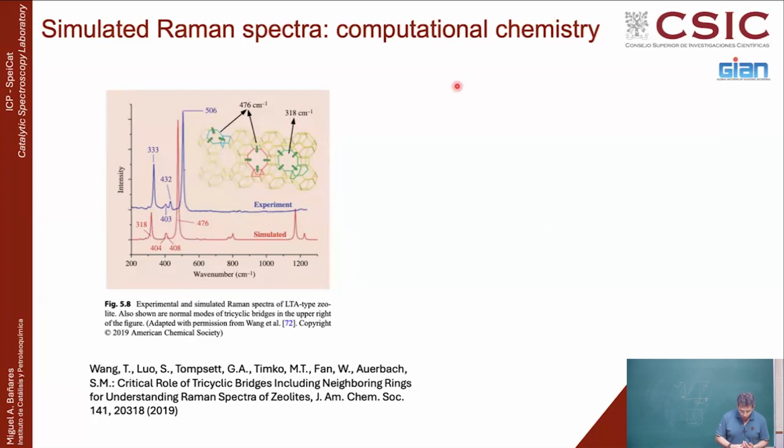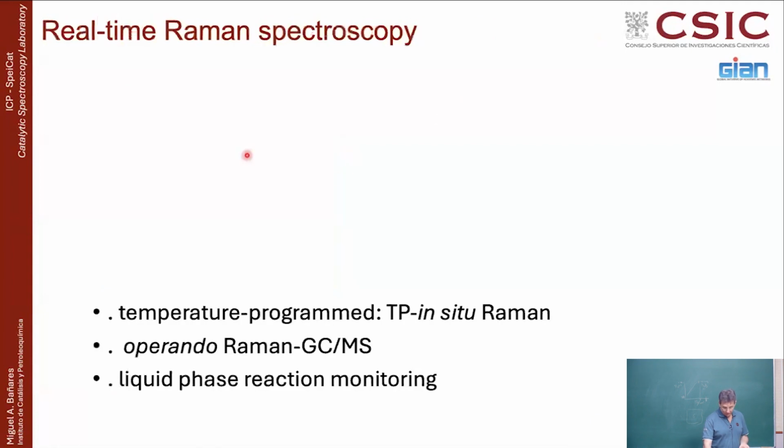So here you have another work from other people, which is already published, about the calculated Raman spectra for zeolite materials under different conditions. So you can see that there are many things that can be calculated, and for instance, there are shifts, there are differences between the experimental and the simulated spectrum, but you already start to get quite a good correlation. And in our case, we managed to get an even much better correlation than what you can see here. But in the end, Raman vibrations are associated with the rings of the different silicon, oxygen, aluminum atoms within the different kinds of matrices of the material.